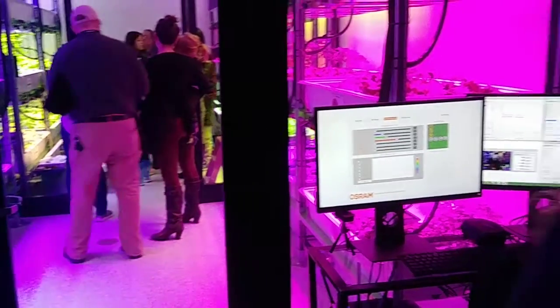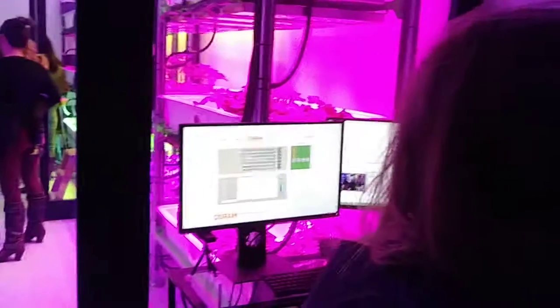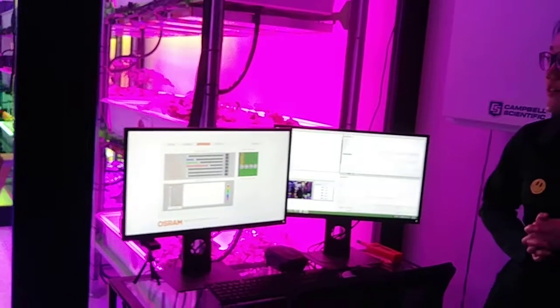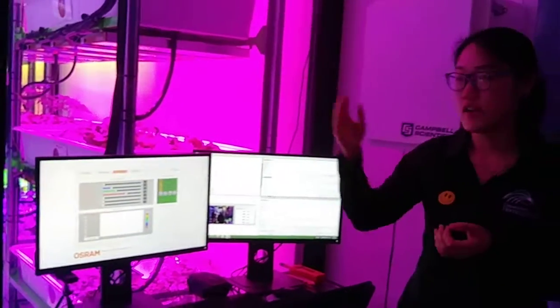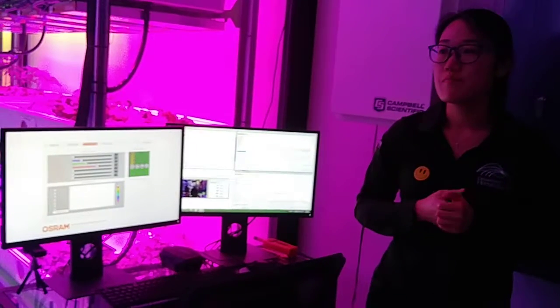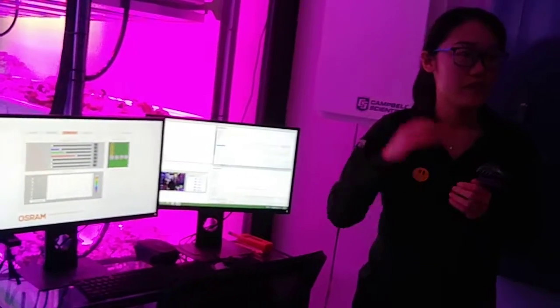Under this closed controlled system, you mentioned some disease and so forth. What kinds of issues or problems are you seeing with this system? So we can grow either under hydroponics or in the medium. If you use medium, sometimes you can find there are fungus gnats flying around.